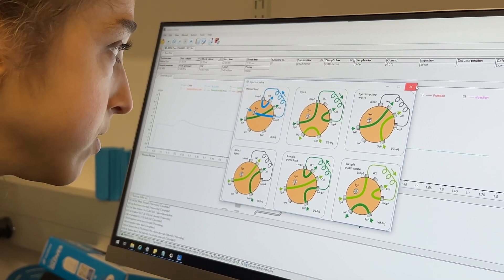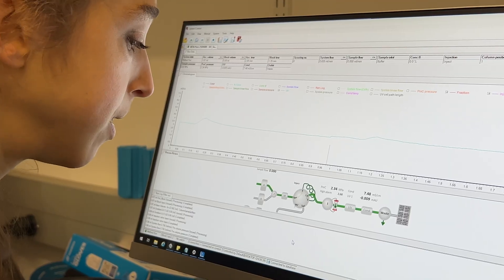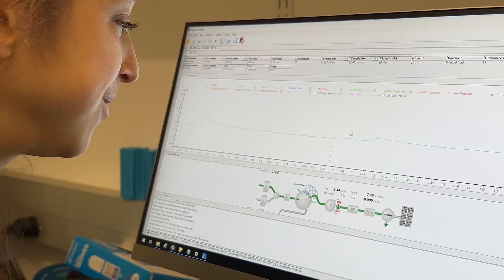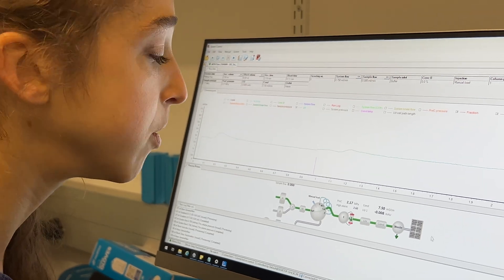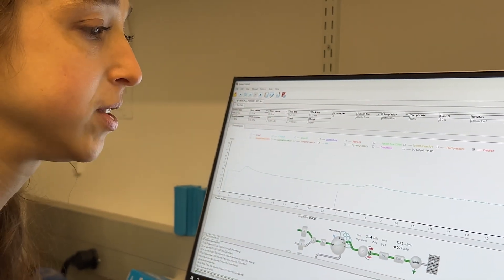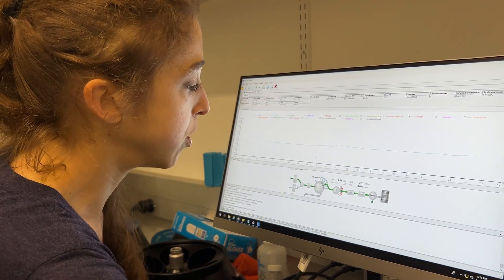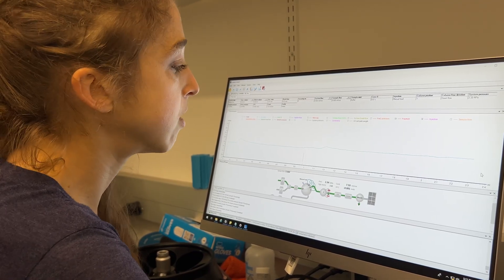We have our needle still in there and we're going to leave it in until the end of the run. As soon as the run's done, we can wash the needle with ethanol — just a few ethanol washes like we did before so we don't get crusty stuff in there. We'll want to wash our loop again too, and then we'll want to save our protein fractions. We're not collecting fractions yet because we're in that void volume — we told it not to start collecting fractions until about 4.7 mils after the injection step. And now we just wait and watch.